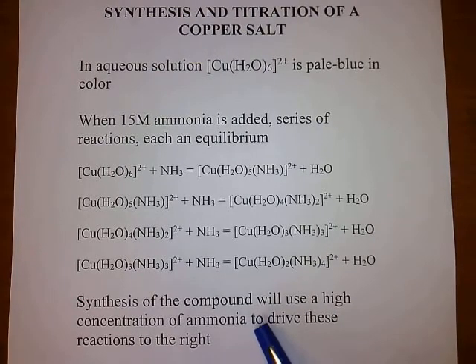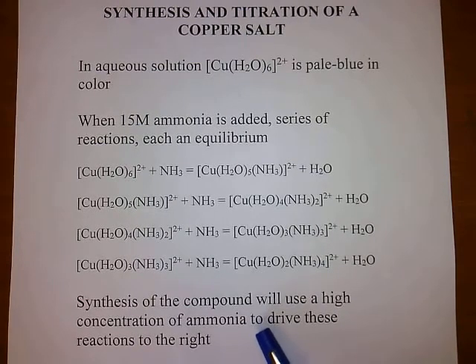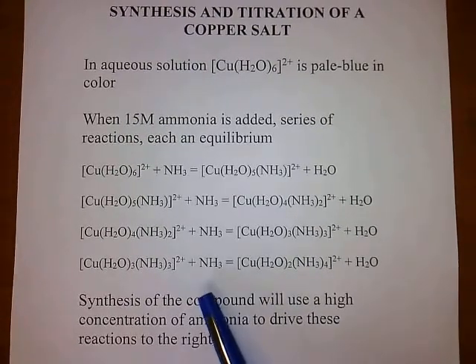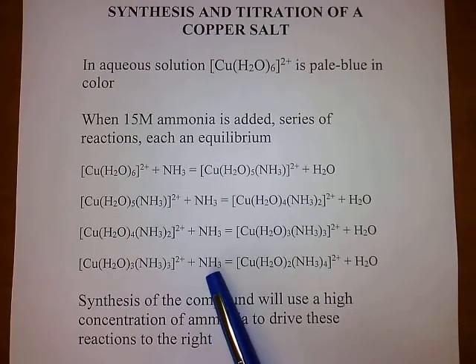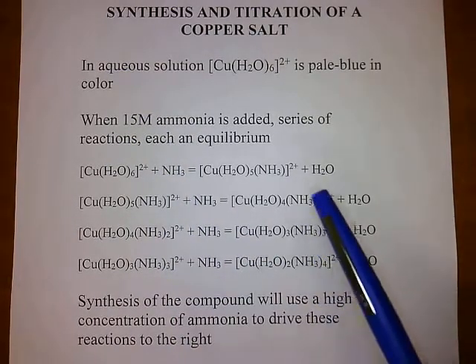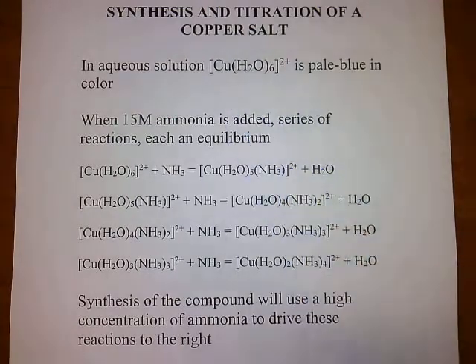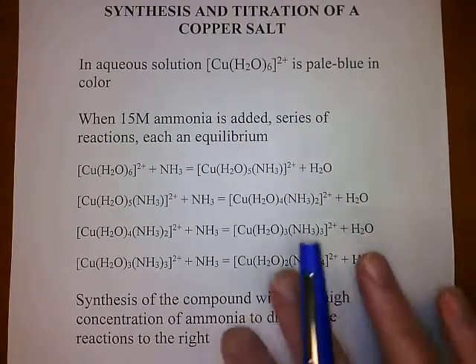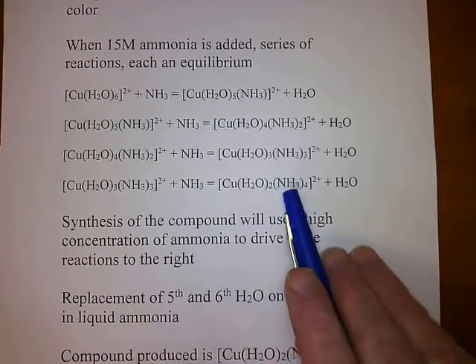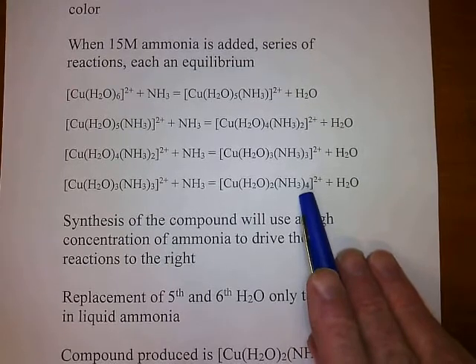In the synthesis of this compound, we're going to use a high concentration of ammonia to drive these reactions to the right. If you remember Le Chatelier's principle from general chemistry, if you want to drive a reaction to the right, you jack up the concentration. You make the concentration higher. We're using 15 molar ammonia, which is very high compared to the concentration of your copper ion in solution. So we're going to drive the reaction to the right, but it stops with the tetraammine.